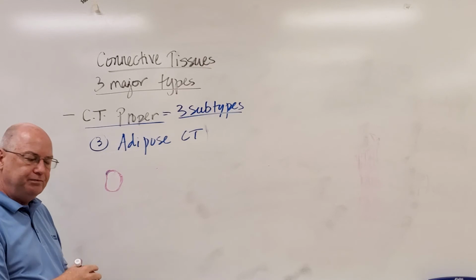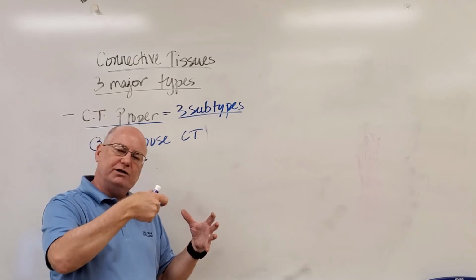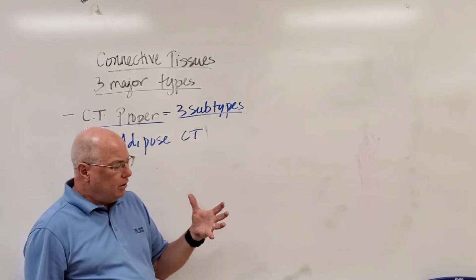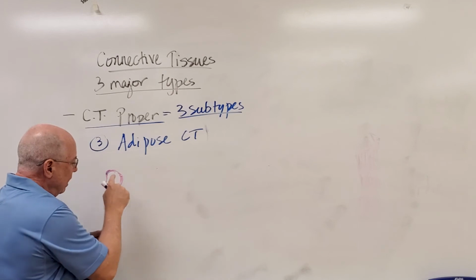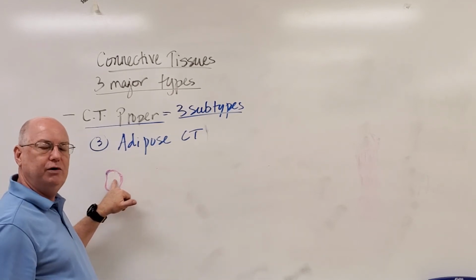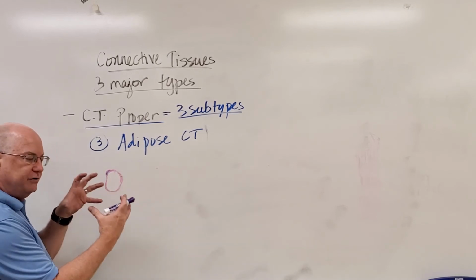They're not empty. You know those rubber bouncy balls that you could buy at Walmart that have nothing but air in them? Imagine if we injected them with Jell-O and then we sliced it open. Well, the walls of the ball would be the cytoplasm, and the Jell-O inside would be adipose tissue, or lipid vacuoles, or lipid bubbles, fat bubbles. And so that organelle gets very large.